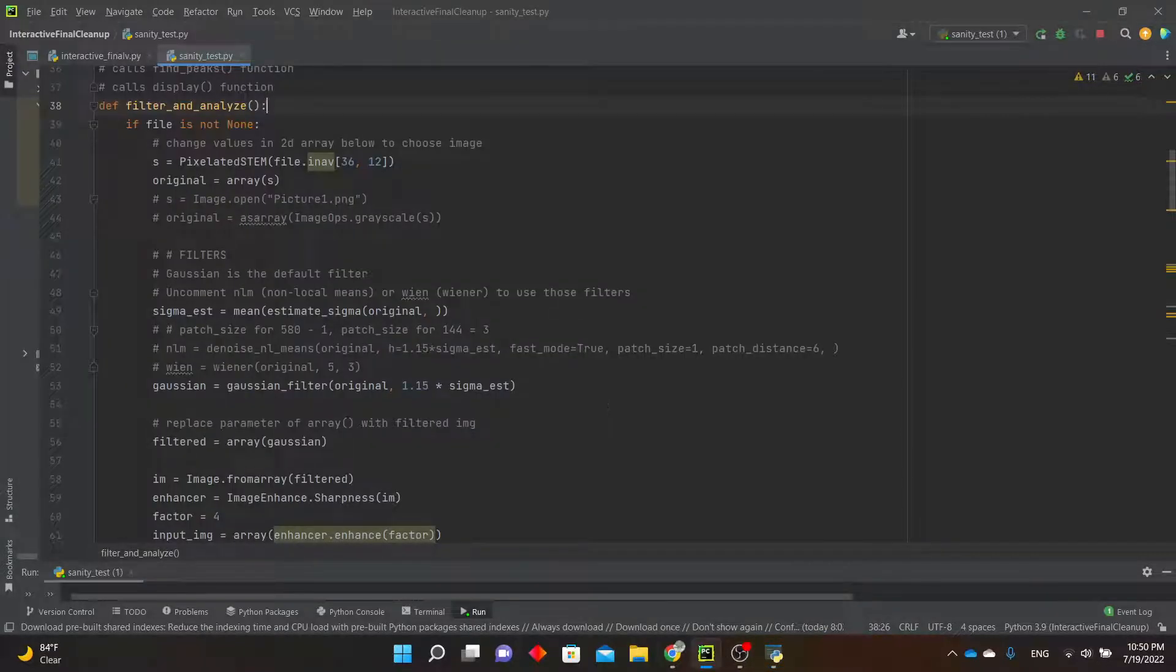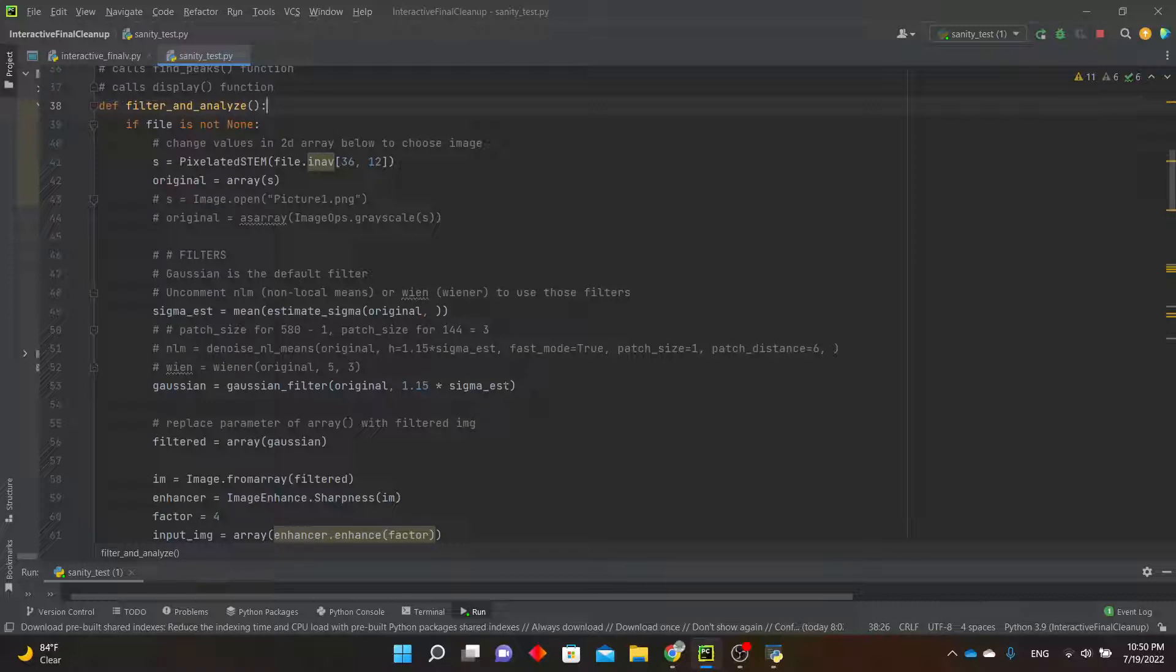If you want to select a different diffraction pattern from the block file, or change the image filter, you can edit the code under the filter and analyze function.